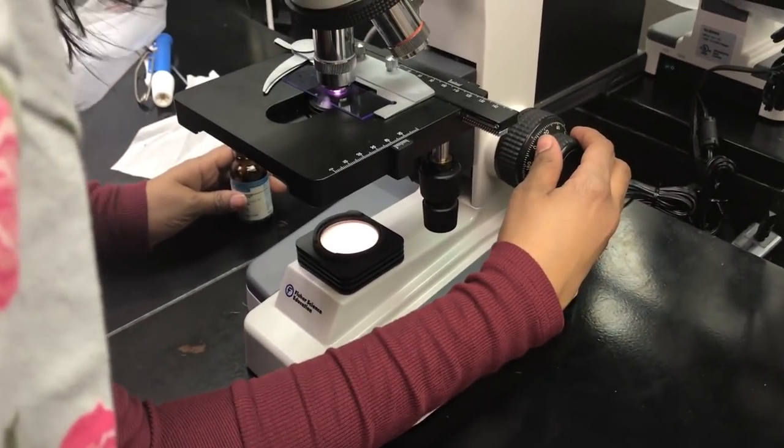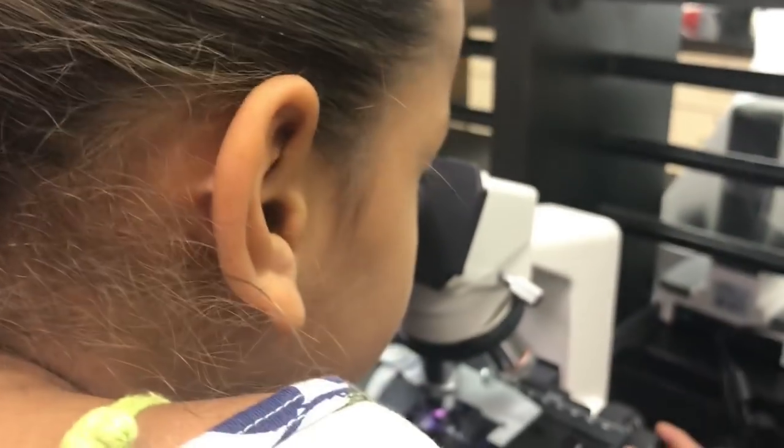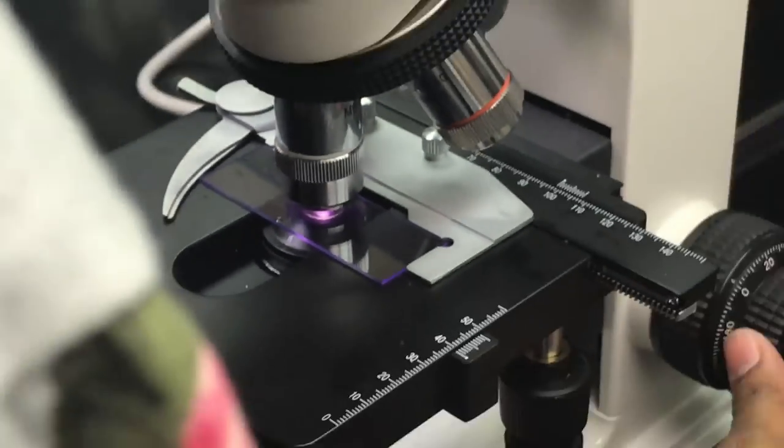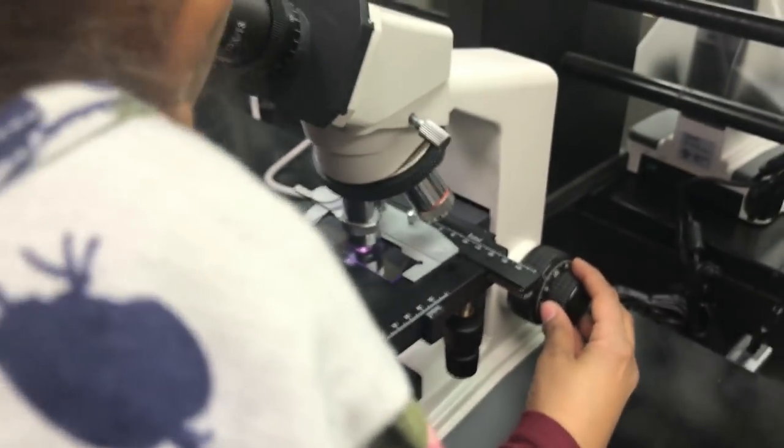Can't see anything. Yes, I'm focusing. Let's see if I can get something. Wait, Janiyah. Yours is rods. These are rods. Is it good that it's rods? Well, there's different types of rod-shaped bacteria.